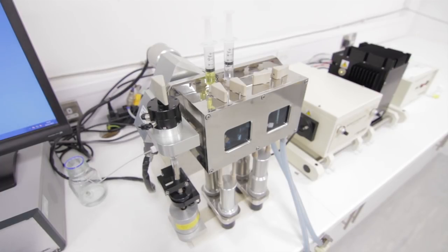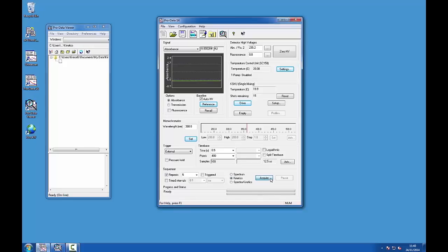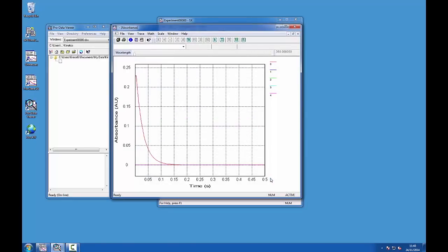Ensuring the drive valves are set to the drive position, click the drive button several times to flush the remaining background solution out of the cell. Finally, click acquire to perform the stop-flow experiment and acquire your data.